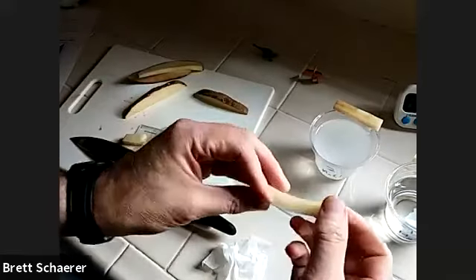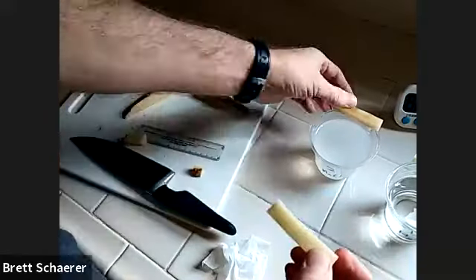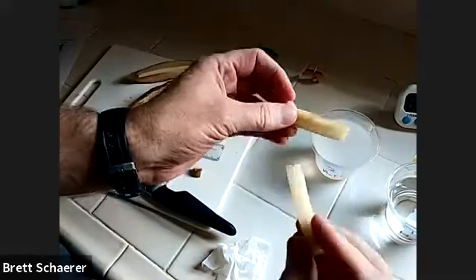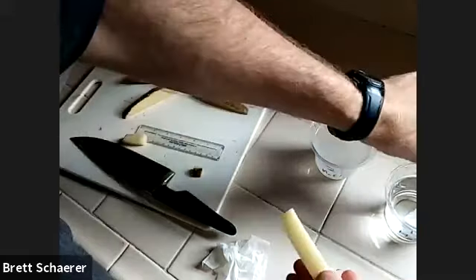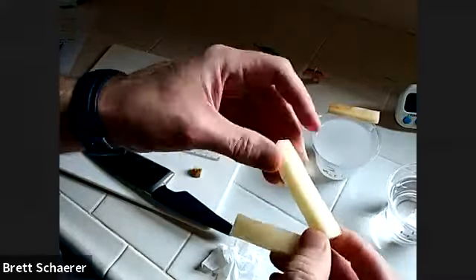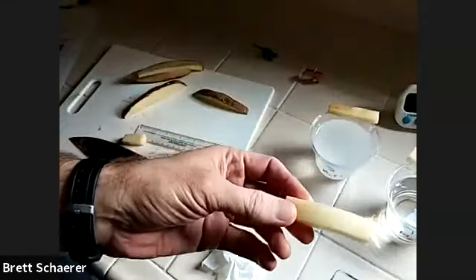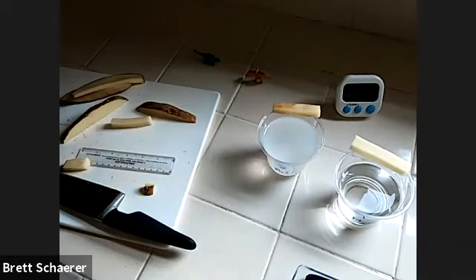So this is a control piece, and it's a little bit floppy, but the saltwater one seems to be floppier, right? But the water one is much crisper, much more turgid than the control piece. So that is it. That is the plant osmosis experiment.